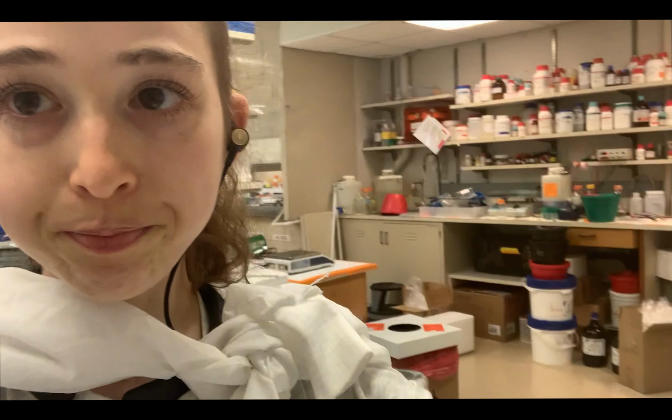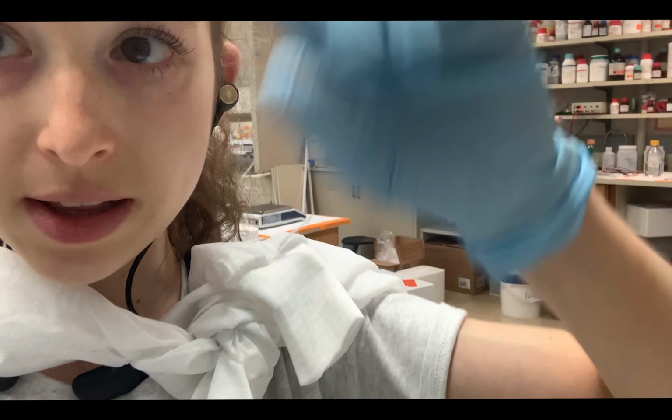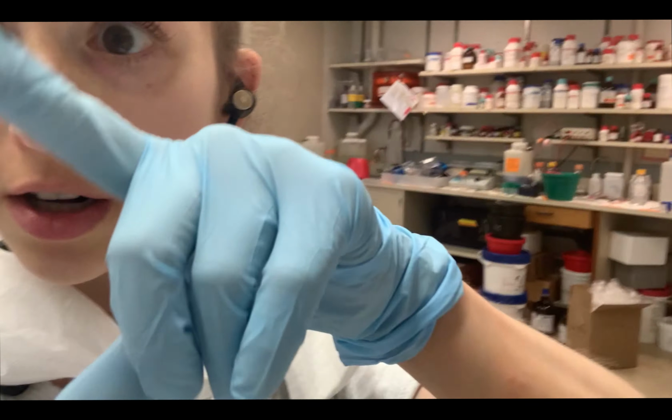I don't know if you can see that because I'm trying to show you my screen. Wrong place. There we go. You spot them like that. And you also spot just the ATP mix, and you're not going to wash that one. Don't wash that one, because that's going to wash off the ATP, which is the point of the wash step.